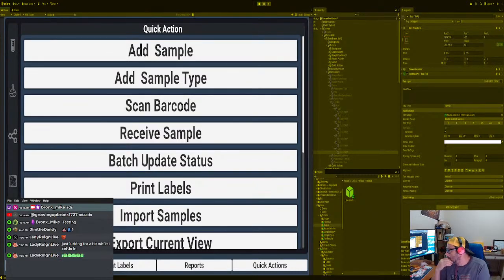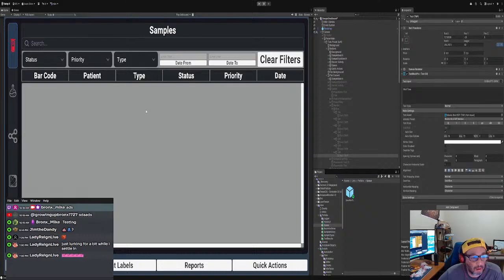All right. Okay, folks. So anything else we need to work on? Yeah, we need to debug all this out because we went really fast to try to finish. We have to look at the sample patient UI, and we got to make sure everything's working properly. What else is there? The headers, and I think that's it. What do you think, Lady Rain? Are you still alive?